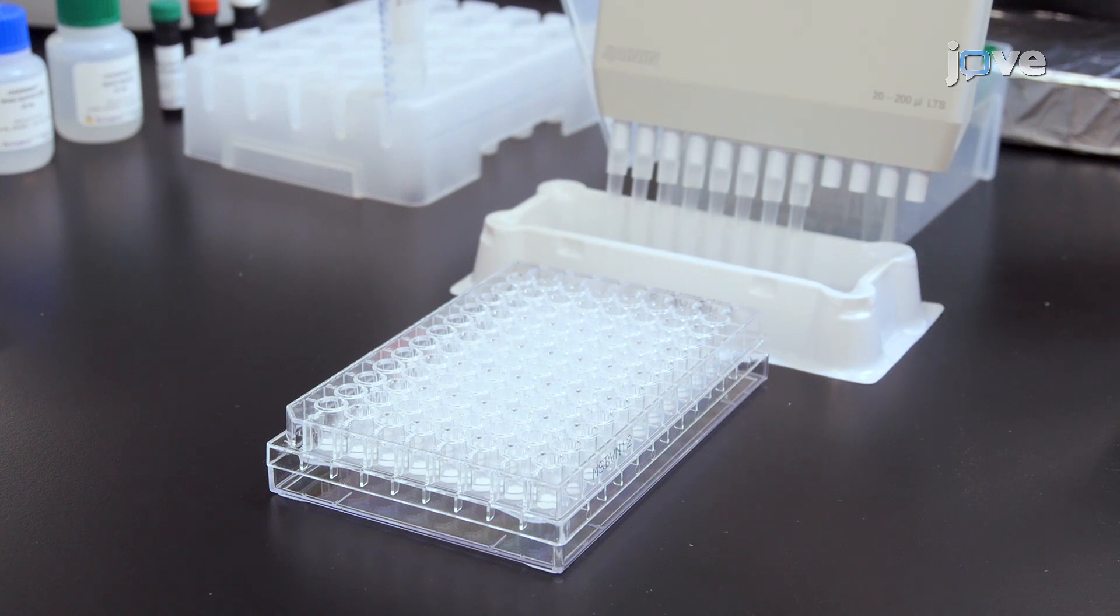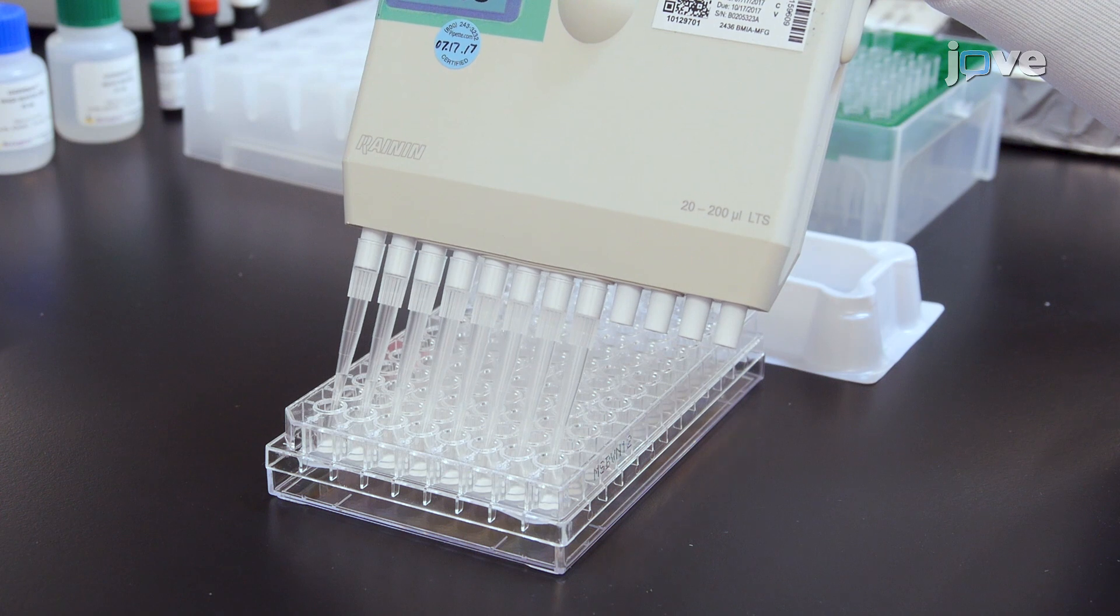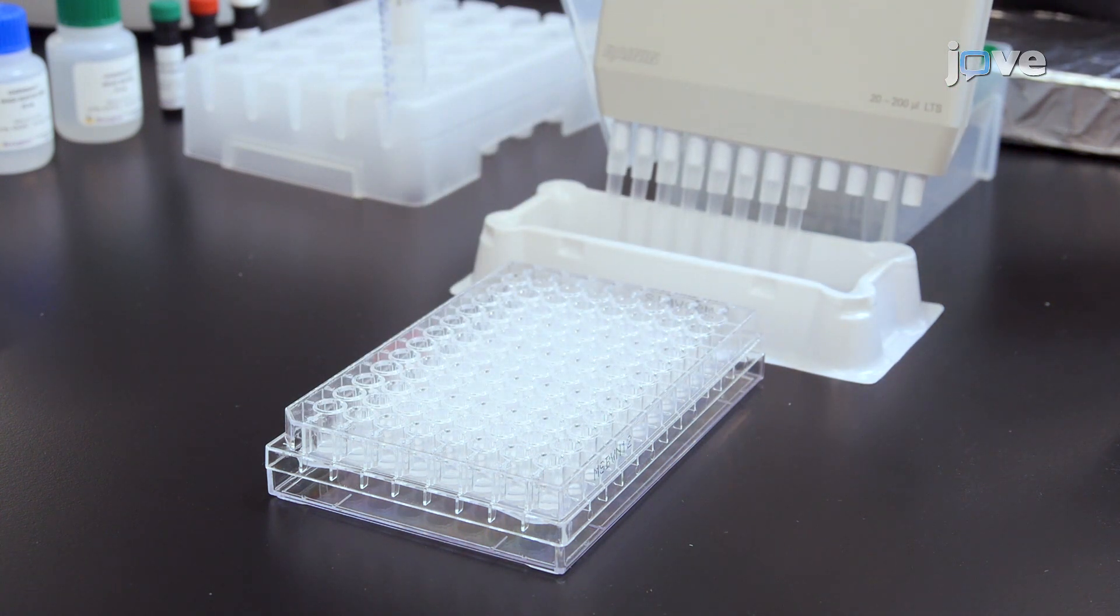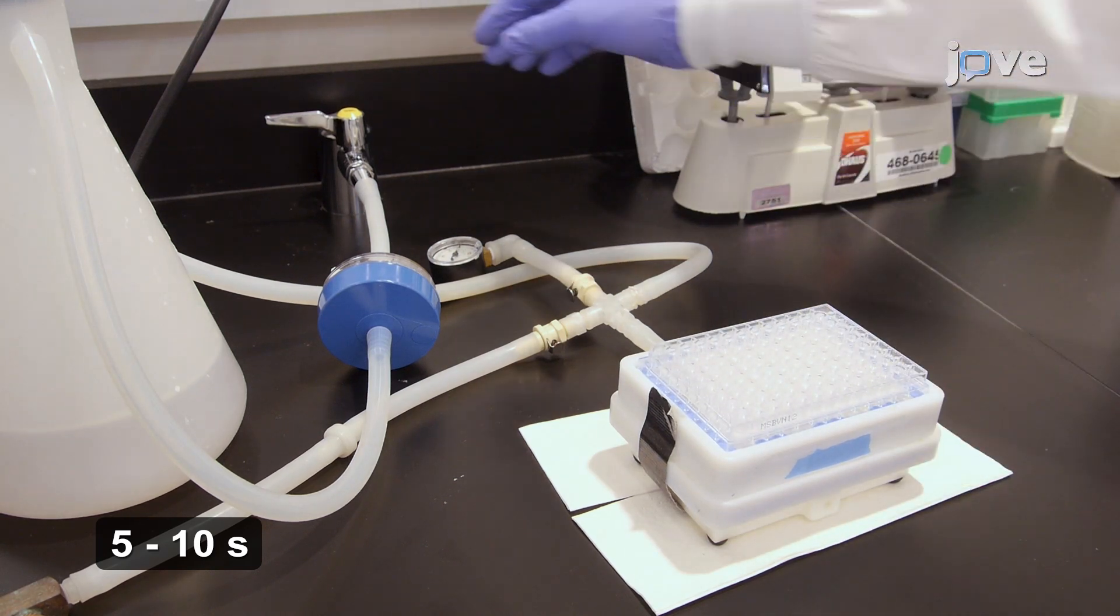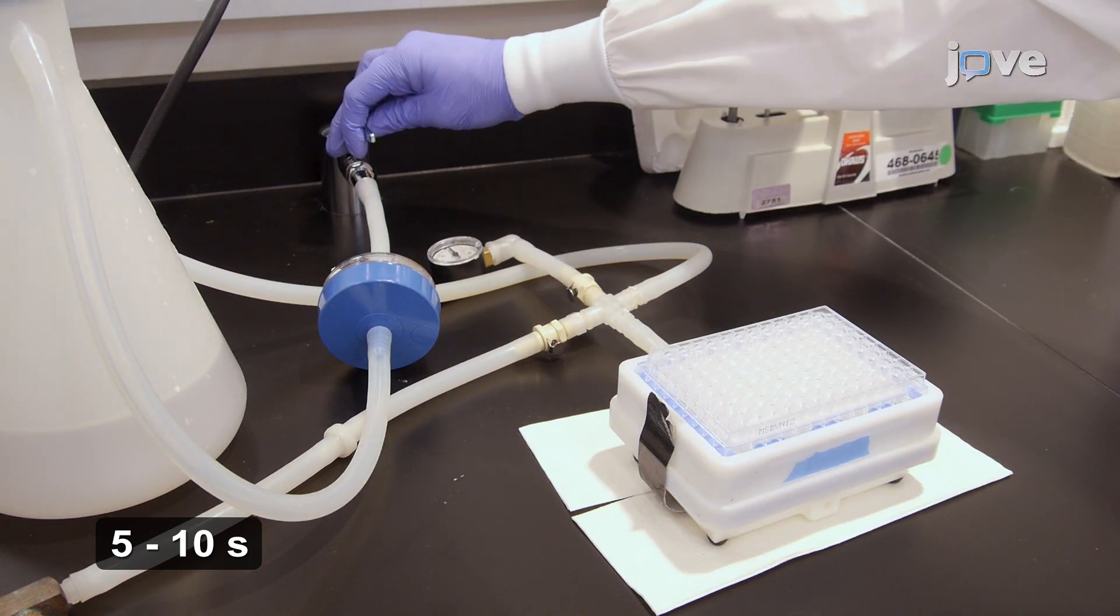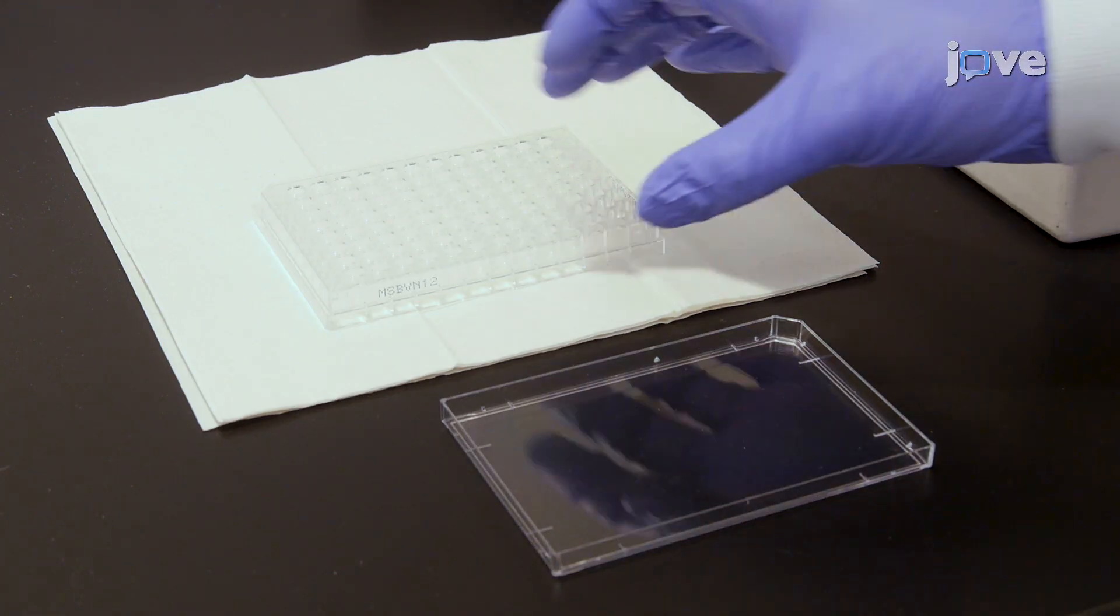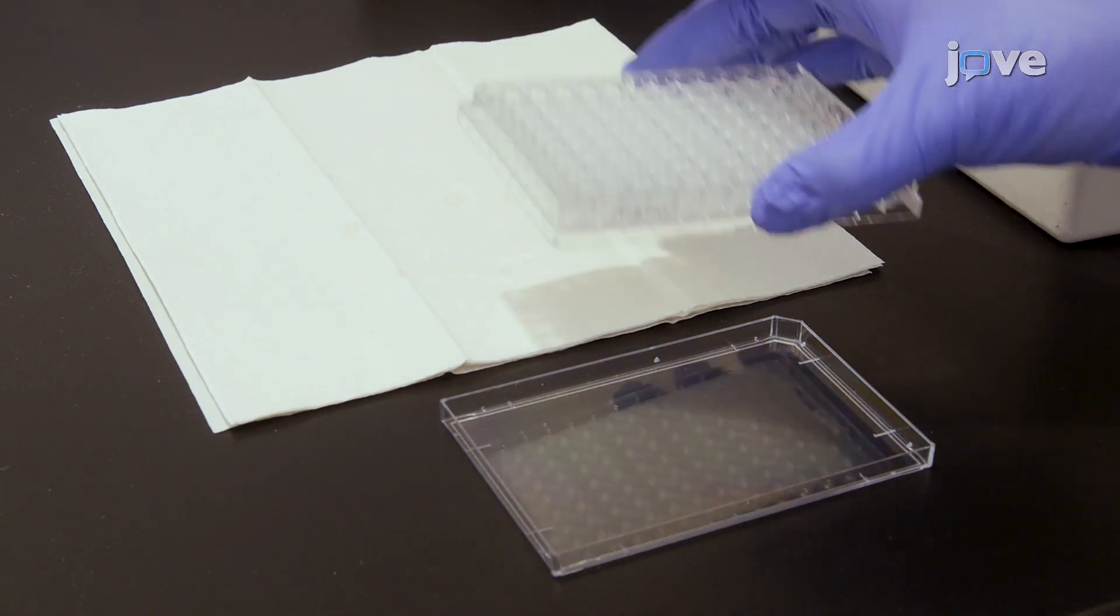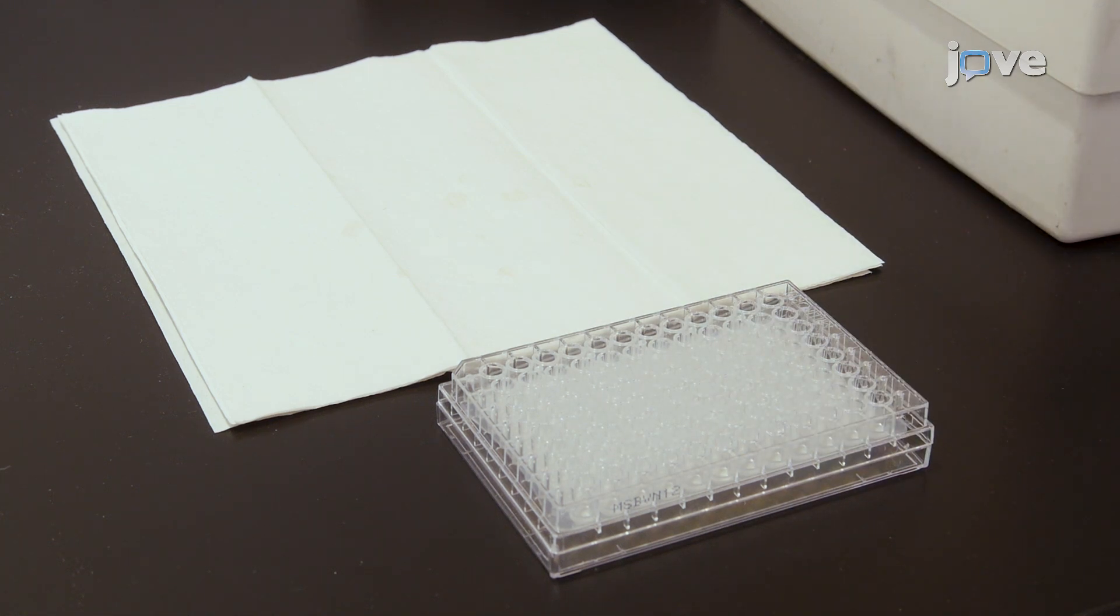Pre-wet the filter paper by adding 100 microliters of 1X wash buffer to each well and let the plate sit for one minute at room temperature. Remove the buffer volume by using the vacuum manifold. Blot excess wash buffer from the bottom of the plate by pressing the plate on a stack of clean paper towels. Then place the plate on top of the inverted plate cover.